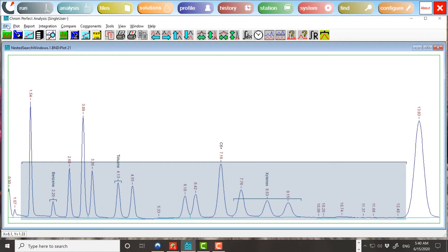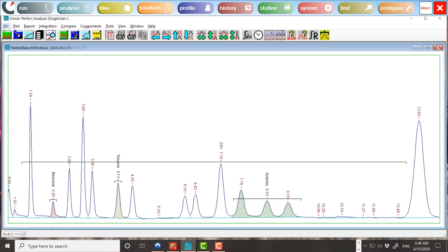If this was the end of the story, then this calculation could be performed with a multi-peak window. But the same region also contains peaks due to aromatic components. These must not contribute to the C6 plus fraction. Instead, they must be reported individually using their own response factors.